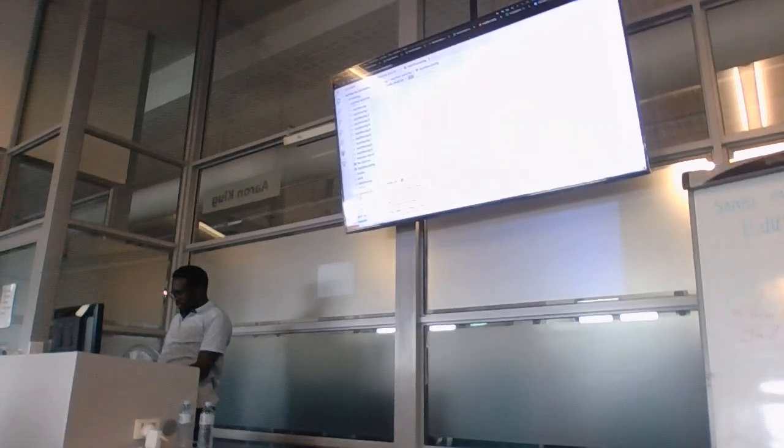So let me see. But that means that your fastp command line is probably wrong, right? Yeah, because it's got as fastp running, but then that must be wrong.